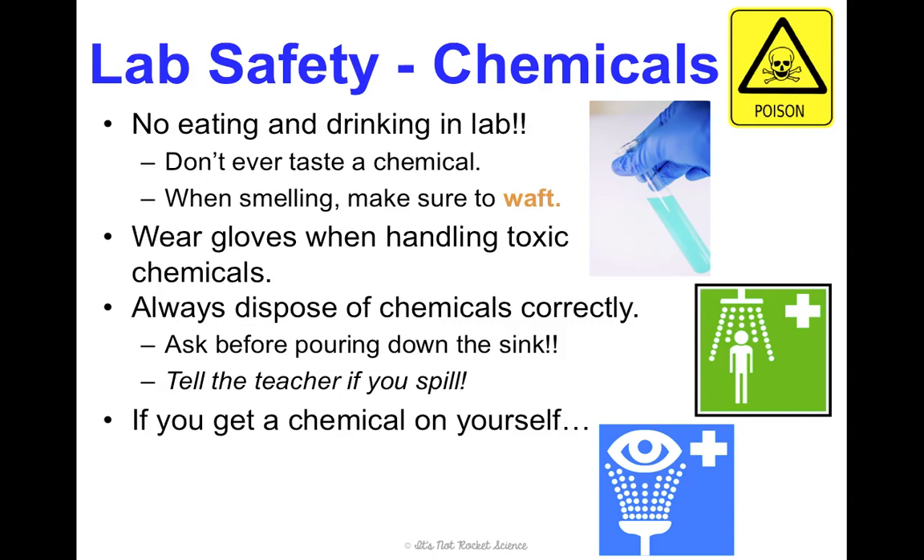If you get a chemical on yourself, the two pieces of equipment we will use are the eyewash and the safety shower. The eyewash is like a water fountain for your eyes — you'll rinse your eyes for about 15 minutes. The safety shower is exactly what it sounds like: a shower for rinsing chemicals off your body.